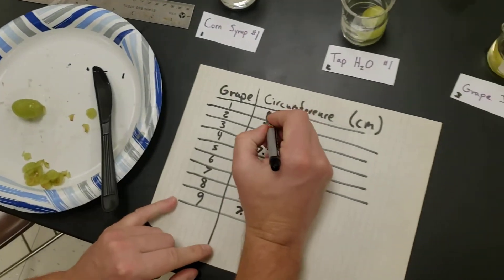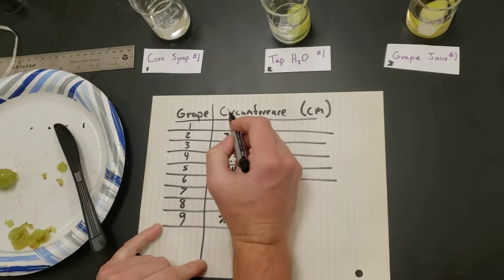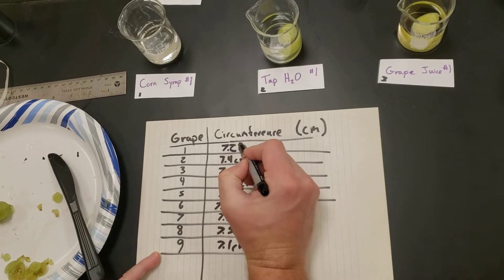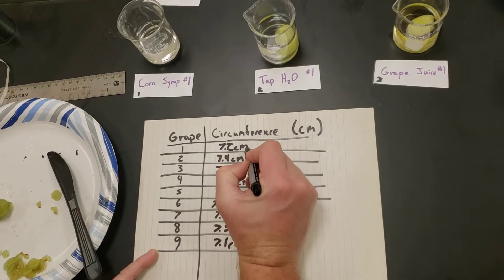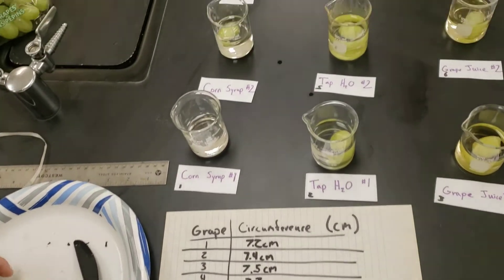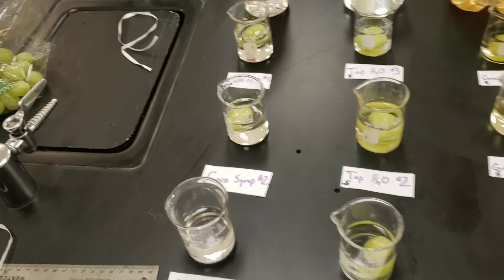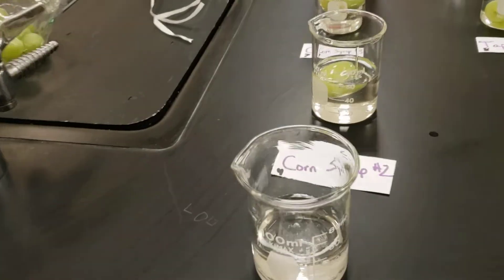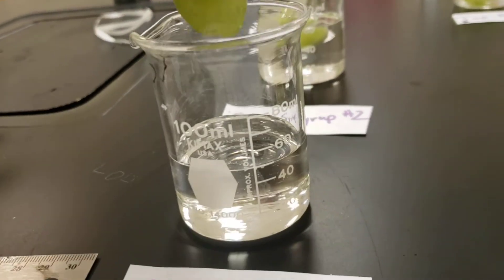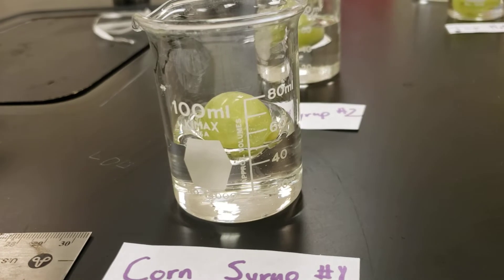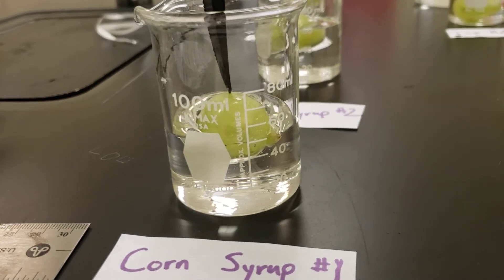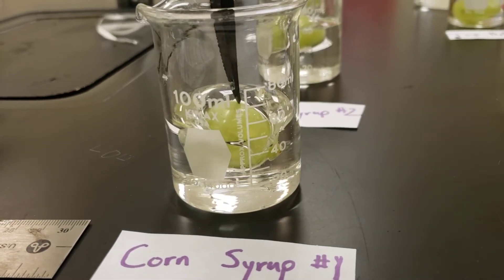I'm going to write 7.2 centimeters down into my data table — this is Grape One, left blank to show you how we did it. Now we're gently going to put this into the liquid. This one's the corn syrup, so it's going to be a bit difficult, but we're going to try to submerge this as much as we possibly can.